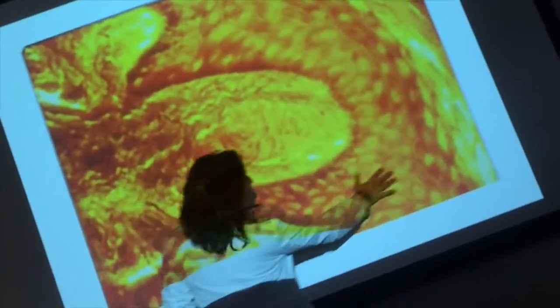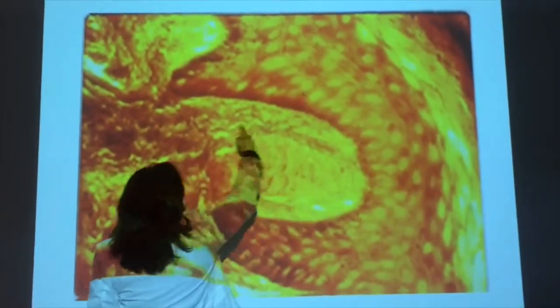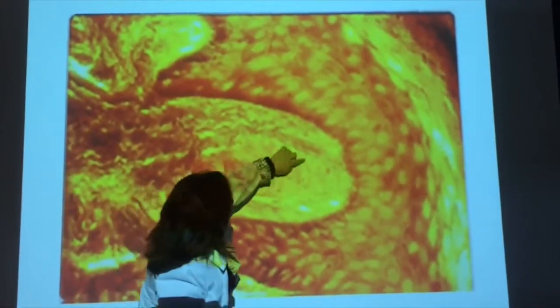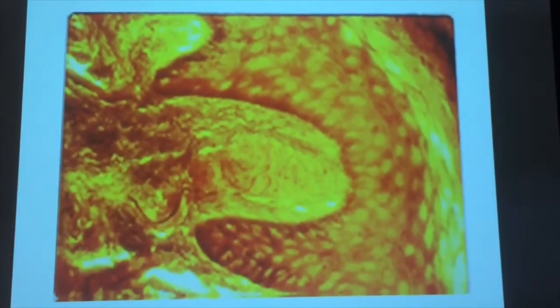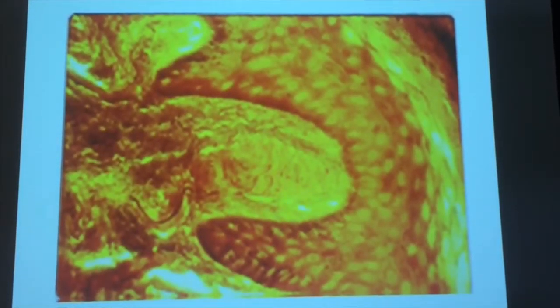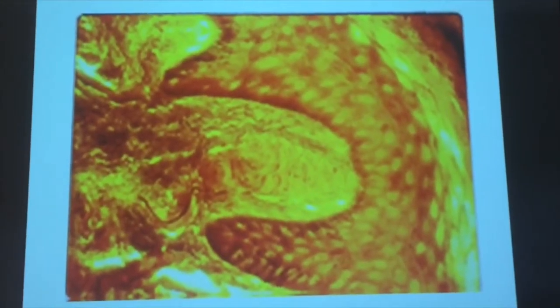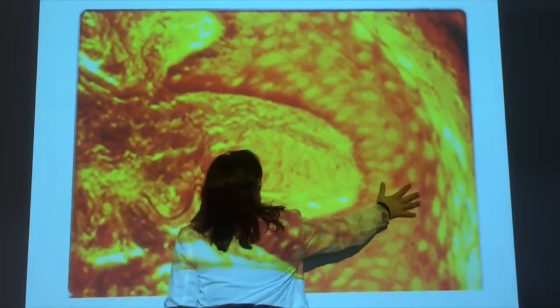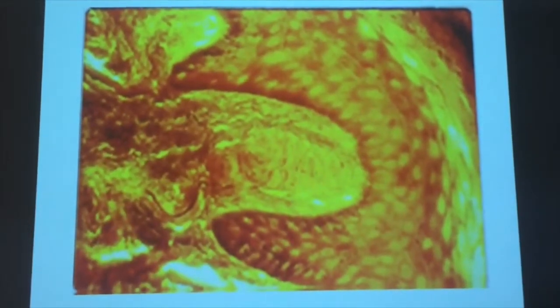Remember that this is the epidermis. This is the dermis. This is the dermal papilla, and right in here, it's kind of hard to see, is the Meissner corpuscle. It's got a little bit of corrugation right there, and that's it. Meissner corpuscle. That's where it is. So remember, basically it's light or discriminative touch. And remember, epidermis, Meissner corpuscle, nerve fiber, dermis. That's it for that.